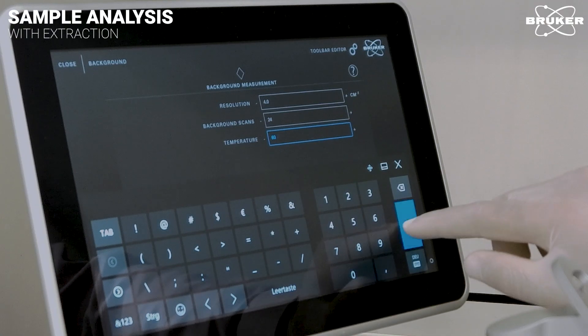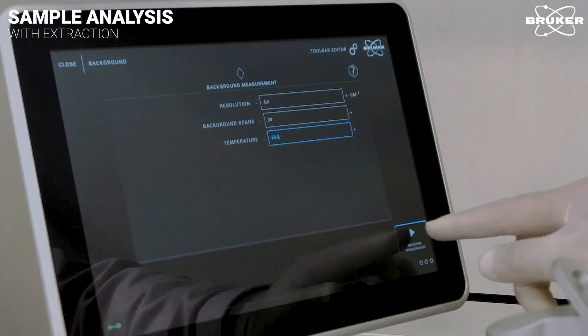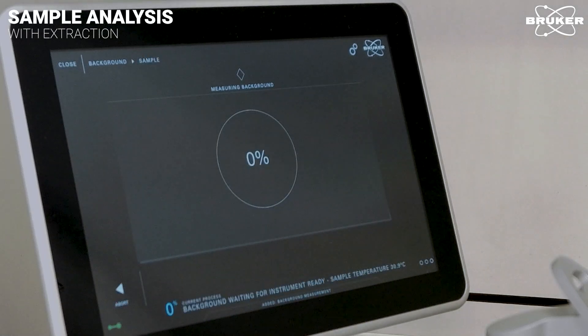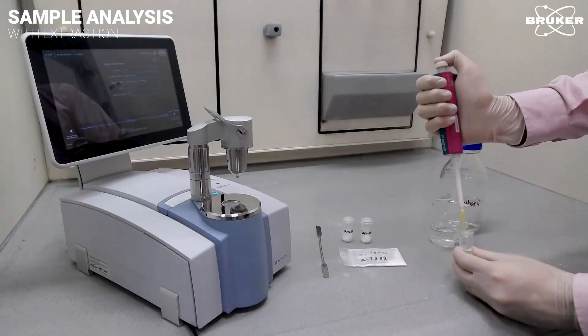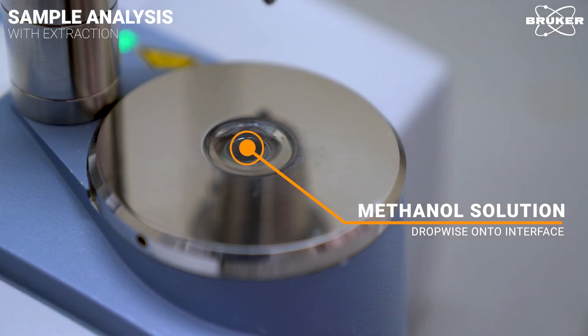For this experiment, we set the temperature just below the boiling point of methanol. After that, the background is measured without any sample present. Then, a pipette is used to apply the methanol solution dropwise onto the heated measurement interface.